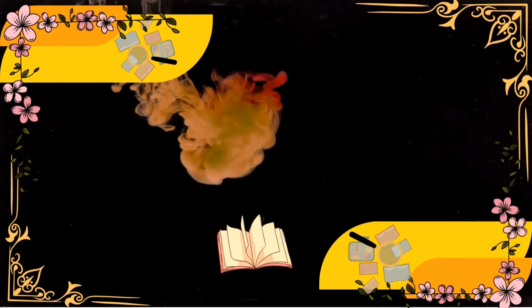During photosynthesis, plants absorb carbon dioxide from the atmosphere and convert it into sugars, releasing oxygen as a byproduct. An IRGA can monitor the reduction in the carbon dioxide concentration in real time, giving a direct indication of the photosynthetic rate. This is typically done by enclosing a leaf in a leaf chamber that is connected to the IRGA, where the gas exchange can be measured continuously.